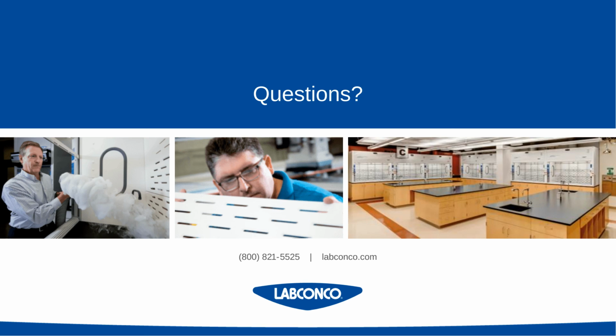Thank you, Kasey, for that answer. So it looks like we've got one or two more questions here. Looking at this one, since the ductless hoods aren't connected to a mechanical system, can a customer move the hood from room to room to cut down how many fume hoods they need to purchase?